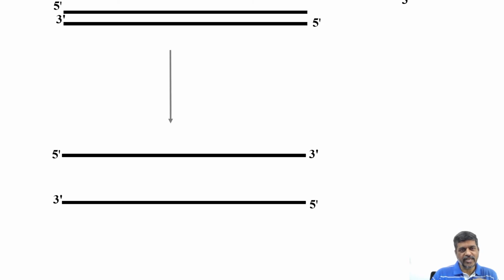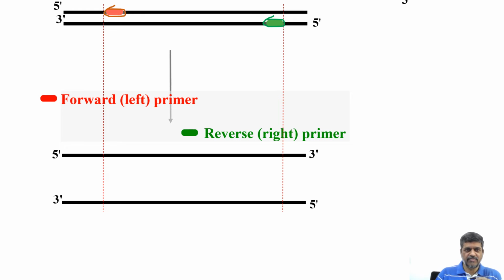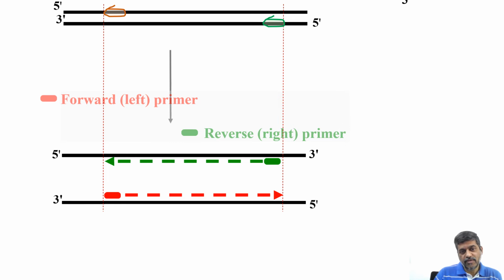A quick recap in a few seconds. You had double-stranded DNA shown in here as a line diagram. I have a target region like this, and I wanted to generate primers. So I took the forward primer like this, marked the region. I went to the other strand, but went to the complementary region, wrote down both the sequences, generated my sequences this way. And when I mix them, this is where the forward primer comes and binds, and reverse primer comes and binds here. And polymerase does its job. It will complete the polymerization.